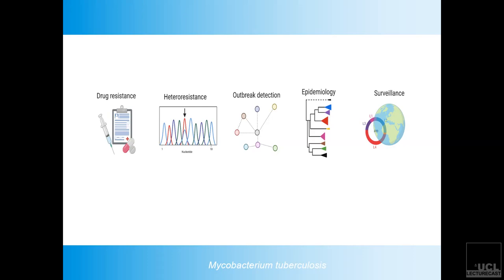I'm also able to find the genotypes and the gene. Yes, absolutely. And with this technique, you can literally tell differences within 10 base pairs out of the full copy. And that is what determines, I think, the current standards of determining a true cluster. And that is important in terms of identifying hotspots where you might have maybe a drug-resistant outbreak happening.